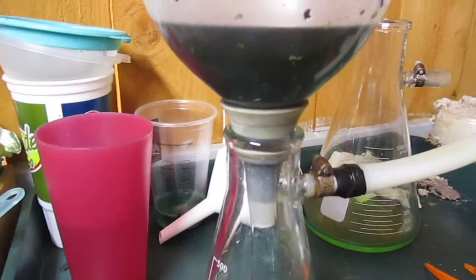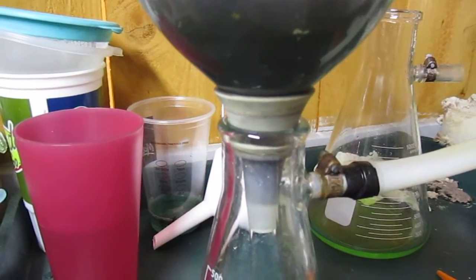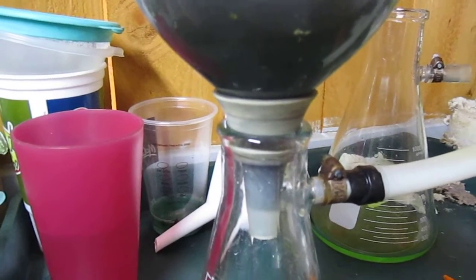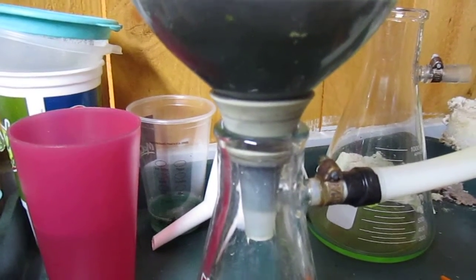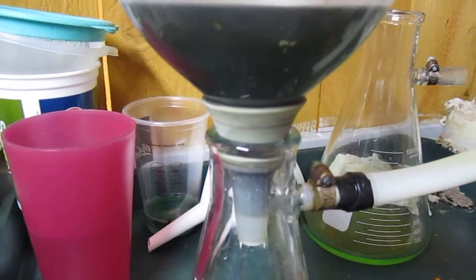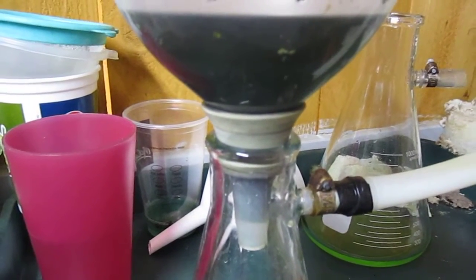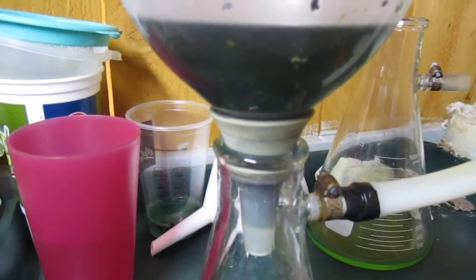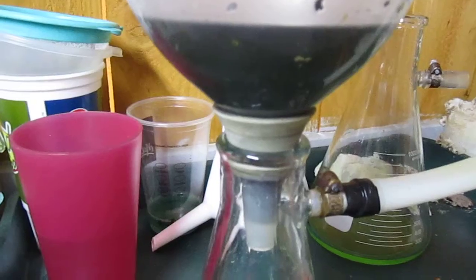Then the plug becomes saturated with fine gold particles. When I'm done filtering, I just place a little muriatic acid and a little Clorox and it cleans up the plug, and it can be reused.